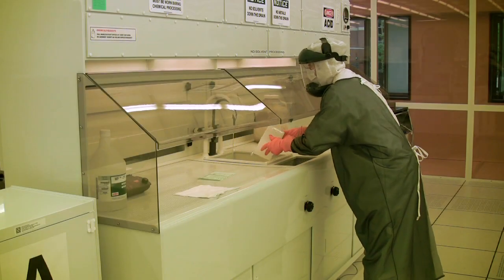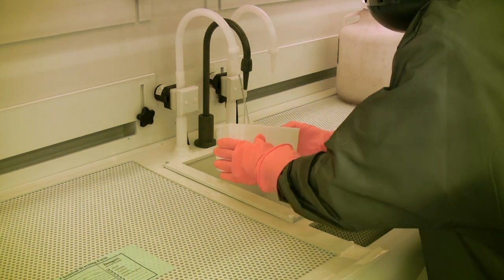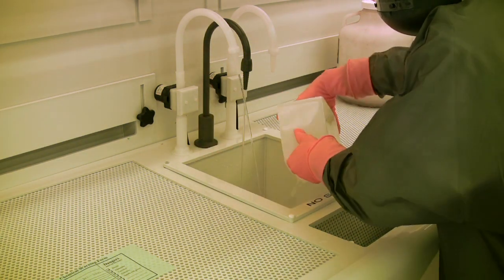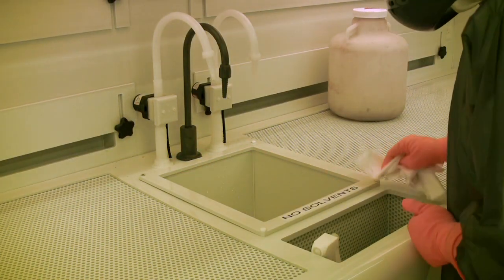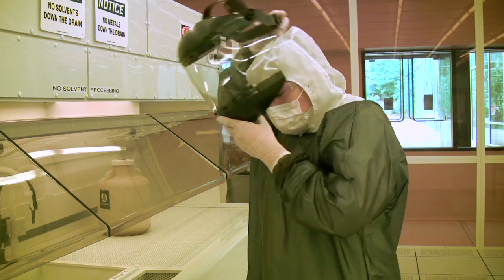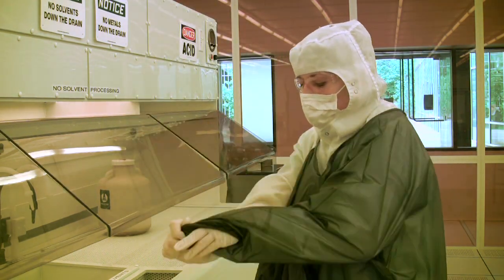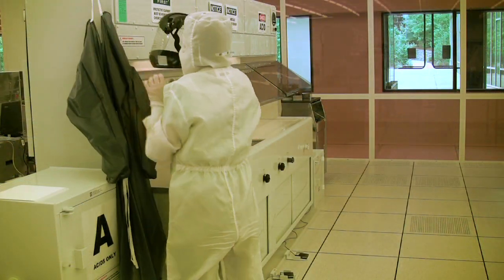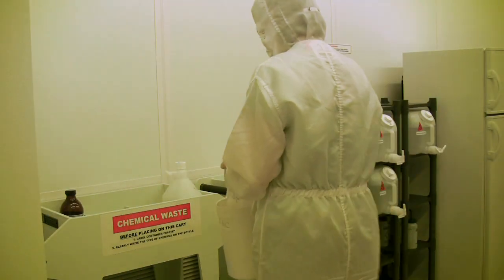Once you have finished disposing of your chemicals, you should begin cleaning up the work area in and around the fume hood, with the idea of having it be as clean as it was when you first started using it. The labware should be thoroughly rinsed three times with deionized water and then dried. The surface of the wet bench should be wiped down so that there isn't any liquid left on it. Once you feel confident that the area is clean enough and safe enough, you can begin removing your PPE. You should then return any labware to the storage cabinet and take any empty bottles or waste chemicals to the designated carts.